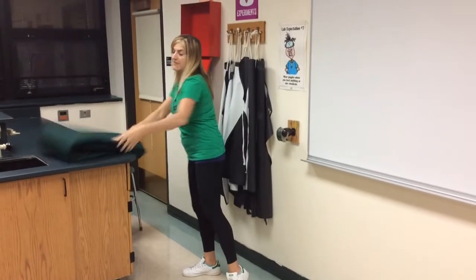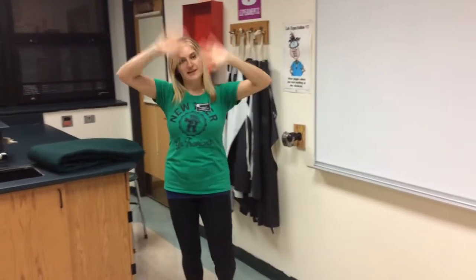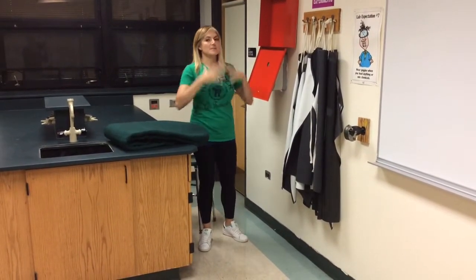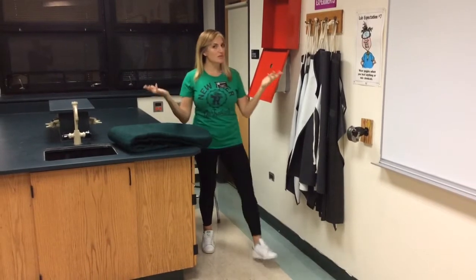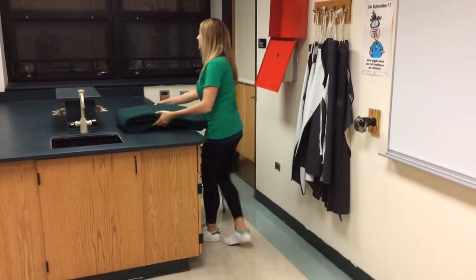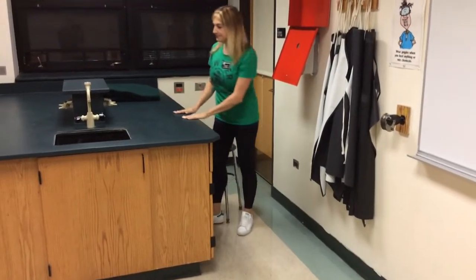Remember, at no point, if you're on fire, should you come flailing for the safety blanket because you're going to cause more oxygen to react, right? And your fire is going to be bigger. So stop, drop, and roll, just like we do in kindergarten if you're on fire, and have a lab partner grab that blanket. Next, I'm going to talk about the gas jet.